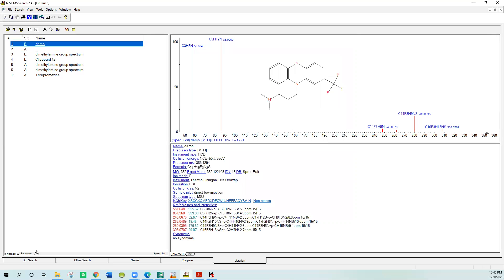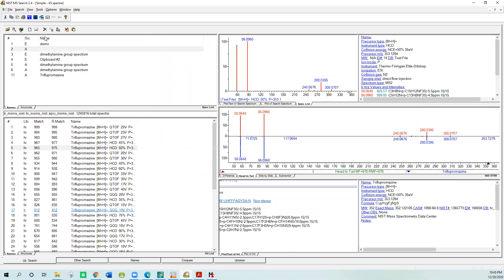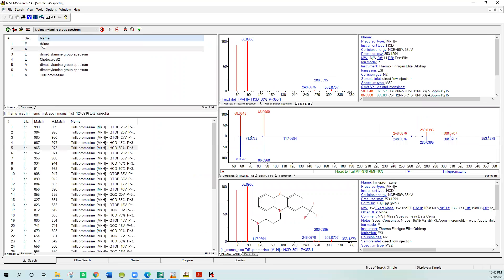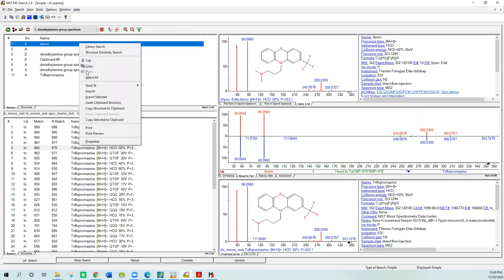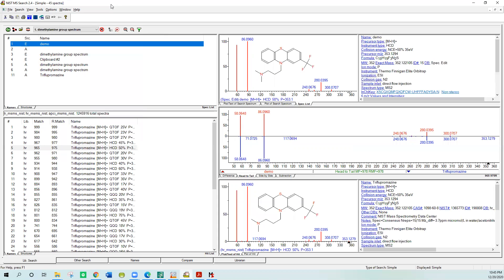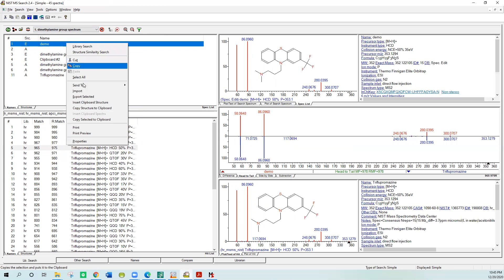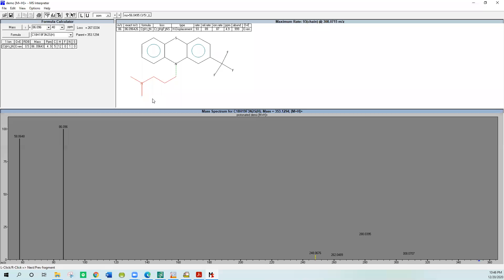Now if you go back to the spec list window and go to the one we call demo, you can see that you have a correlated structure with the mass spectrum. Now to send it to the MS Interpreter program, an outside program accessed by the NIST search program, you can right click and say send to MS Interpreter, or you can push F9 on the keyboard. I'll do send to MS Interpreter.